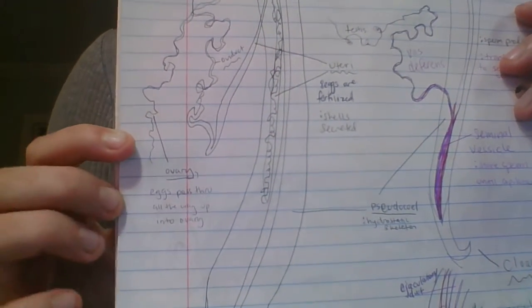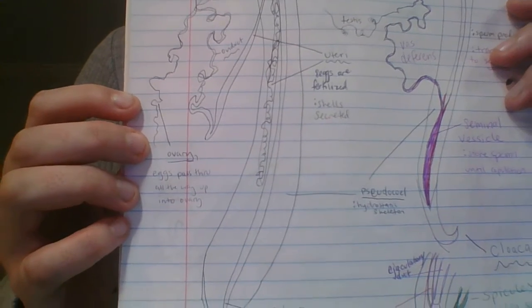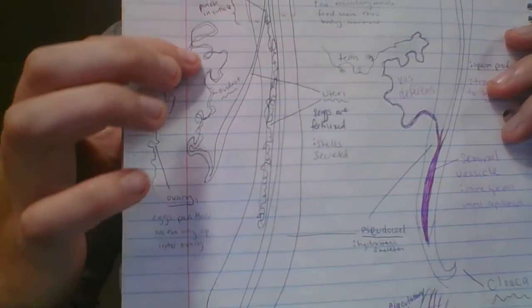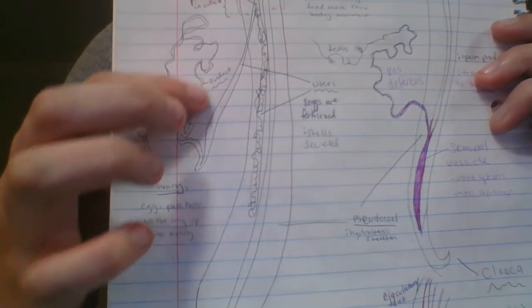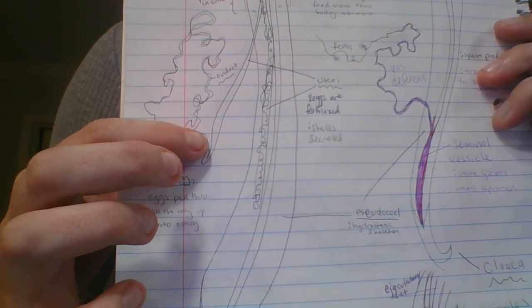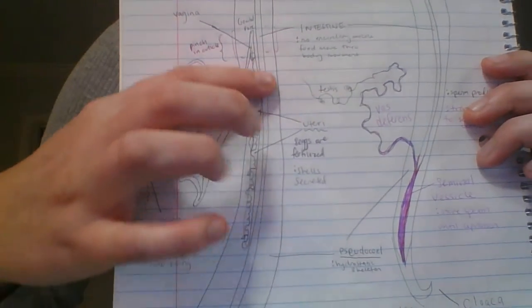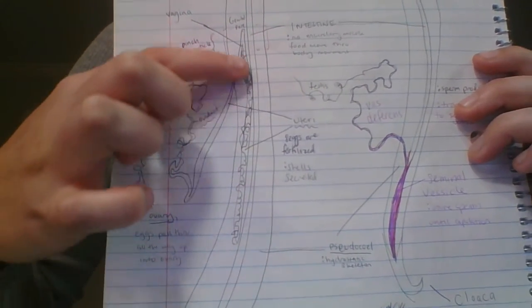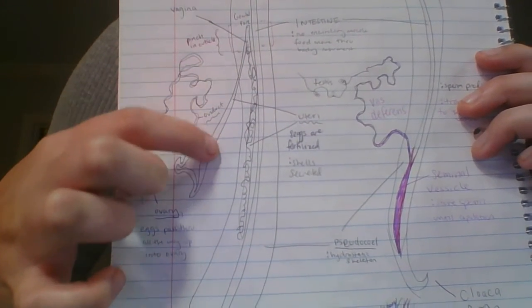On the female side, we have ovaries. This is where the eggs are formed. But following this up, we see the oviducts. This is just to transport the eggs from the ovaries into these two uteri, which are this Y-shaped structure. This is where the eggs are fertilized. This is where the sperm meets the egg.